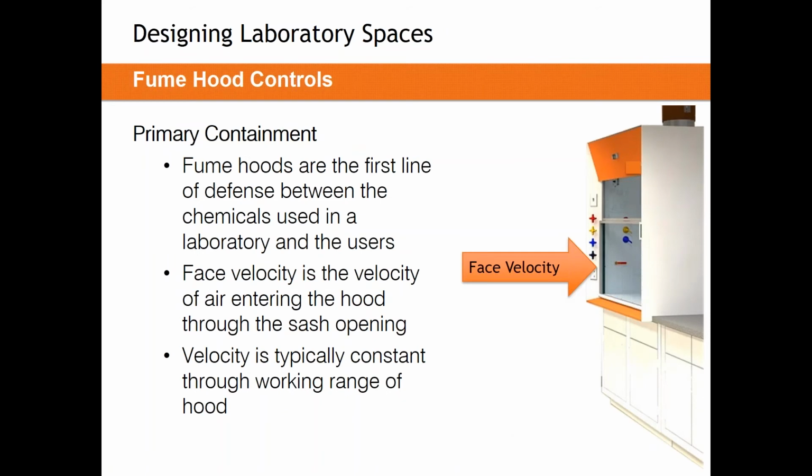Now remember, fume hoods are primary containment devices. They are our first line of defense. So what we need to do with fume hoods is verify that they're actually working. Like most parts of HVAC, with test and balance and commissioning agents and things like this, we need to verify that what we do actually works.